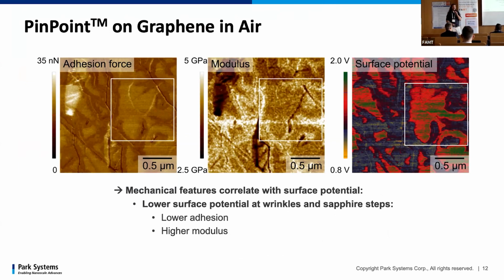Coming to your first question about MFM, magnetic force microscopy. For that, we usually use a cantilever that is evaporated with an additional magnetic coating, usually a cobalt alloy or something like this. And this is surprisingly widely used in industry for mapping and doing failure analysis of storage devices, where we also have very fine magnetic domains, for example hard disks. Also, this is quite important for an emerging field of spintronics and skyrmion based storage devices. So there's actually a surprisingly huge market for that, although it's a niche application for AFM users.